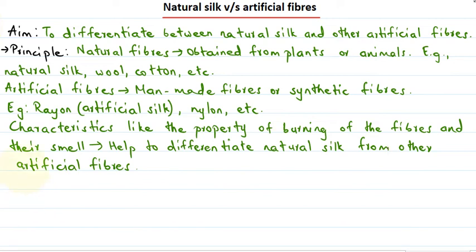Let's look at the materials that are required for performing the experiment.